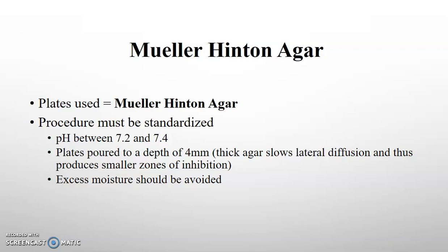We also want to avoid excess moisture when we work with these plates. Kind of just think through the process. If there's excess moisture on the plates and you're putting medication in the plates, what happens when you water down medication? It dilutes it out, so it might not look as effective.